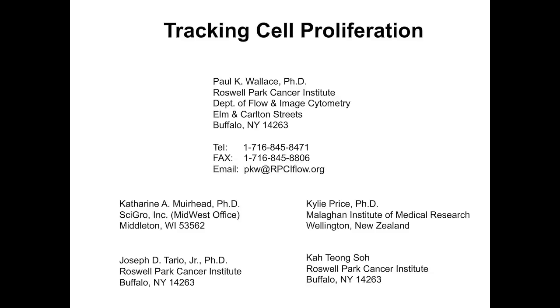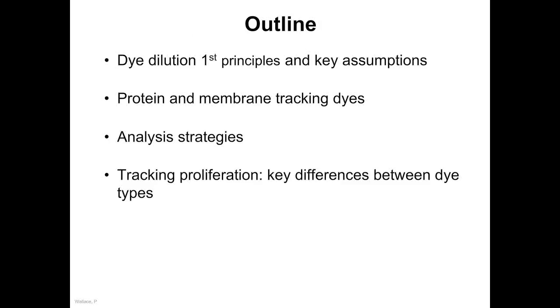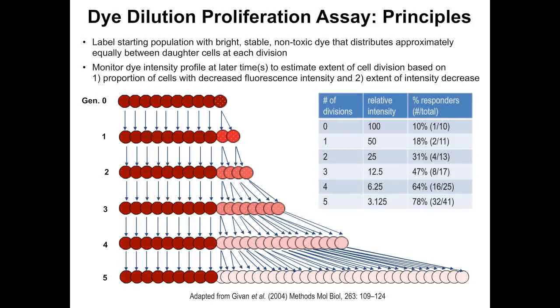So to begin, what I'm going to be talking about is an introduction to what the dye dilution technique is and some of the key assumptions. We'll talk about differences between membrane and protein tracking dyes, just briefly discuss some of the analysis strategies, and then look at some of the key differences between the different dye types.